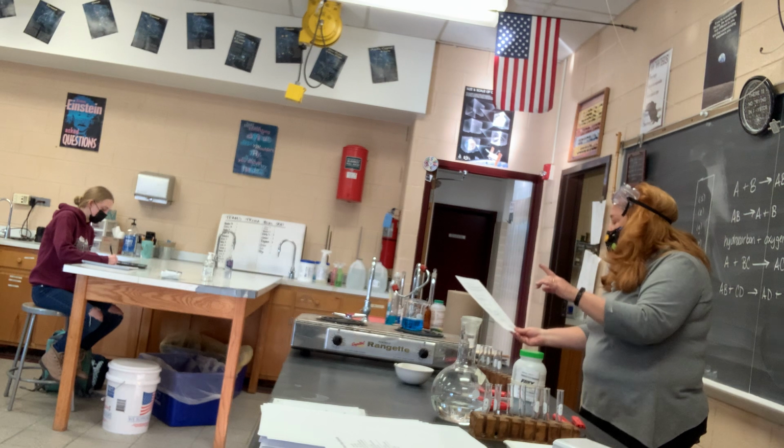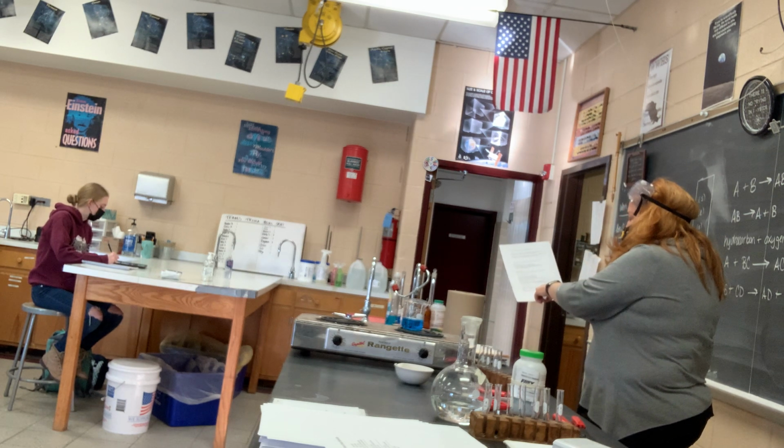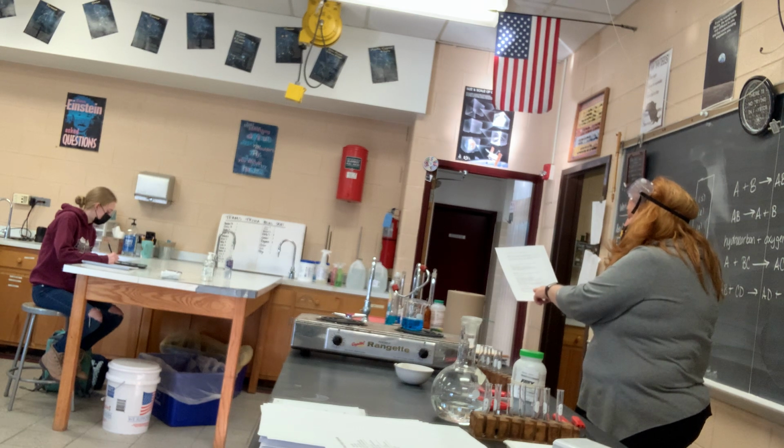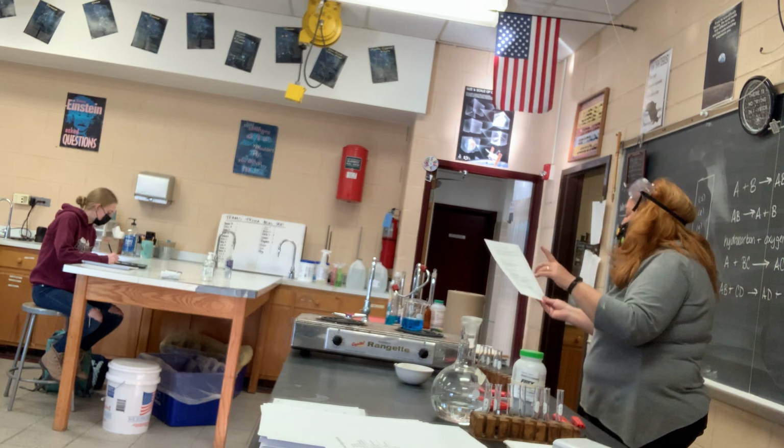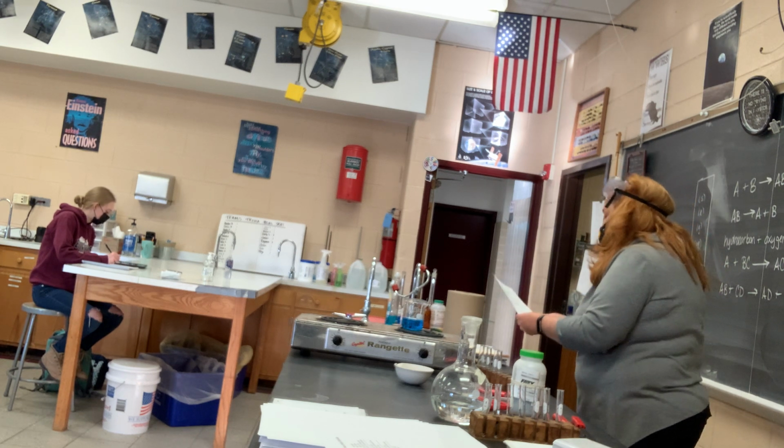This is supposed to be part D. We're gonna come back to this. Plus, copper sulfate, I didn't put the suffix on the sulfate. That's what that should be for number 1. And I'm gonna throw zinc in there in a minute and you'll see what happens. So we're going to jump on over to E while we're waiting for that to warm up a little bit.